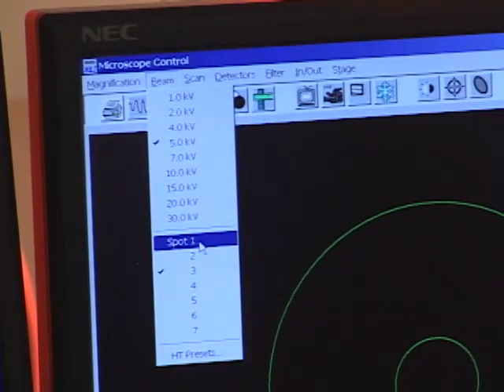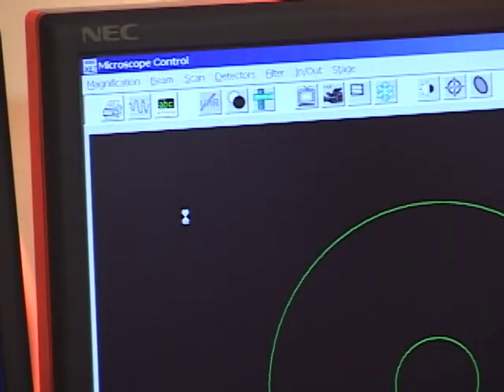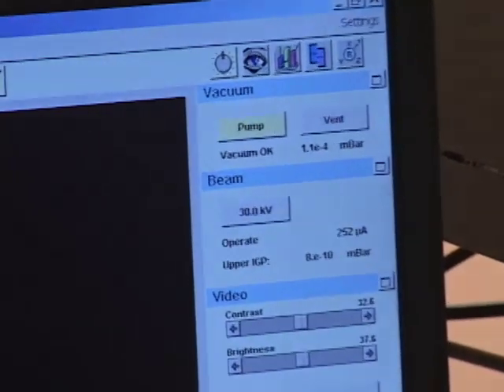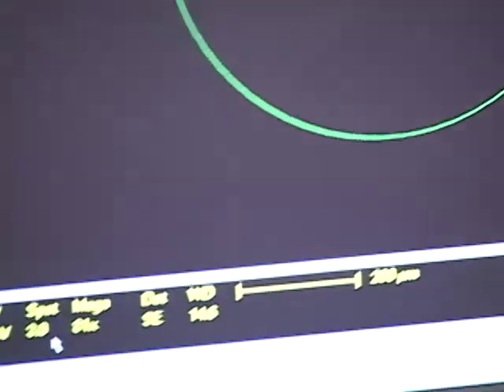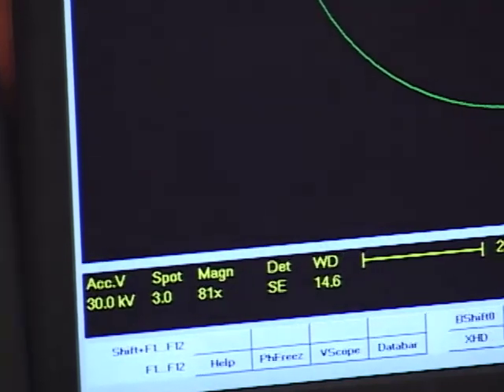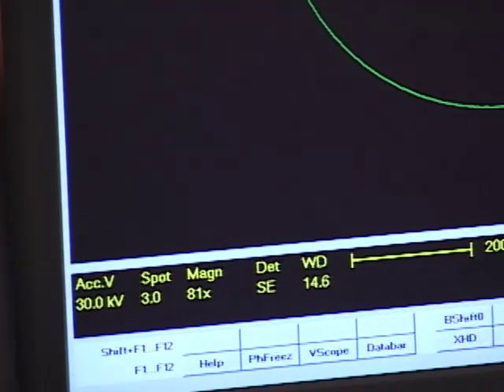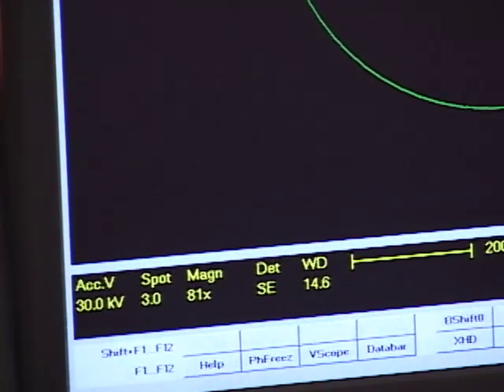So I'm just going to set this one to 30 keV because our standard sample is a really good conductor and it can tolerate this without any difficulty. And then you see that under the beam menu, the button has changed to 30 keV. So it reflects the actual accelerating voltage that you're going to use. Also in the data bar down here, you can see accelerating voltage has changed to 30 keV. Spot size three.